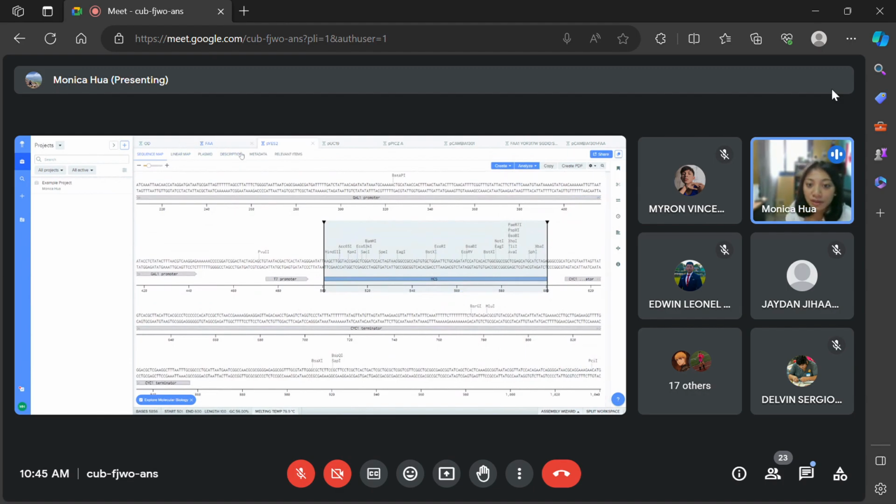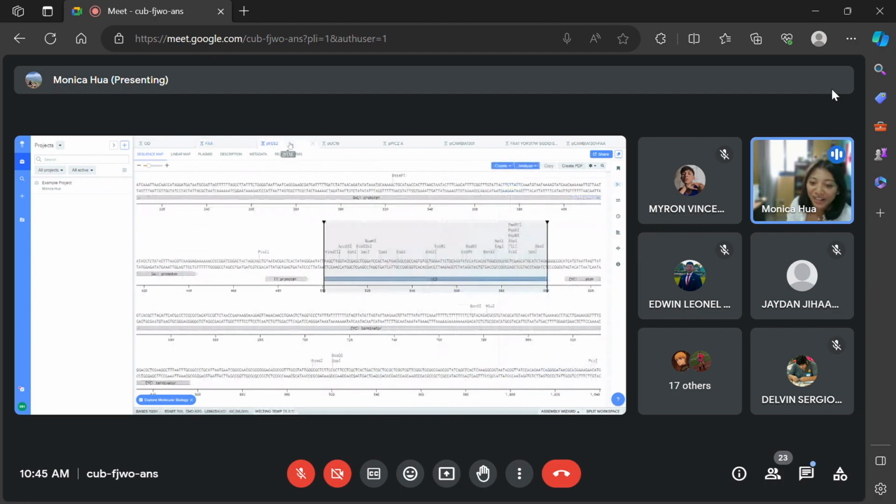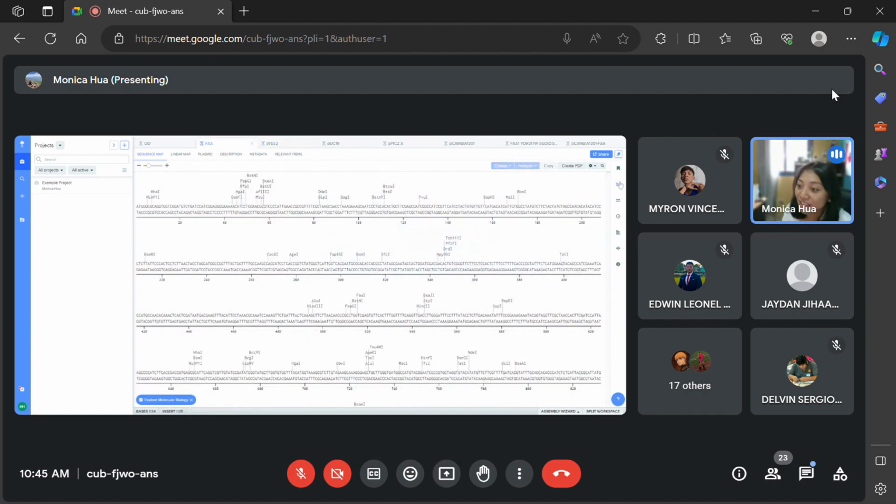So go to your sequence, KPN. Where's K now? HIJK. KpnI. Oops, I have KpnI. All right, can't use that. Eco53kI. It is time consuming.